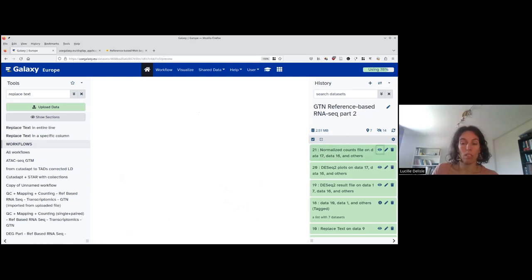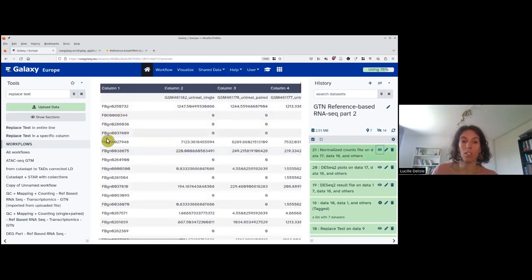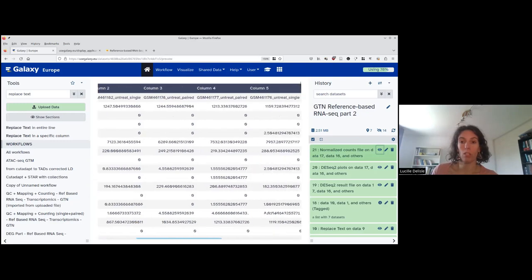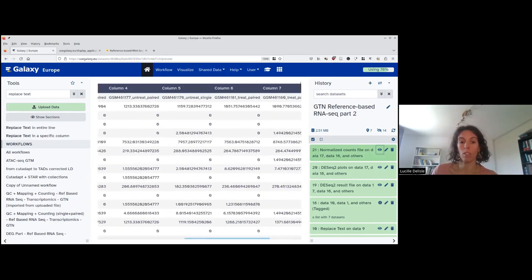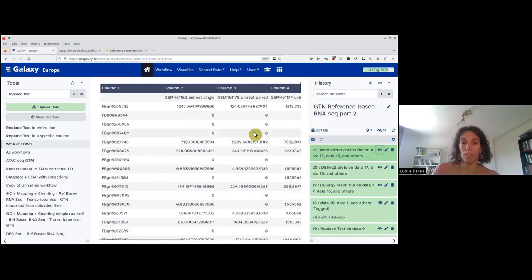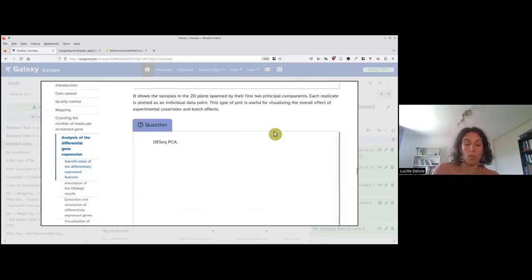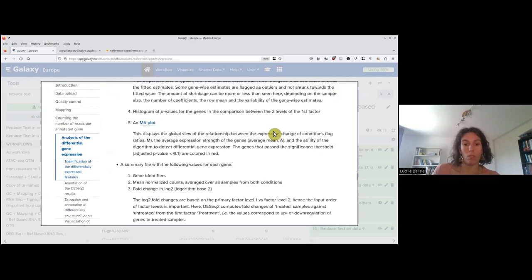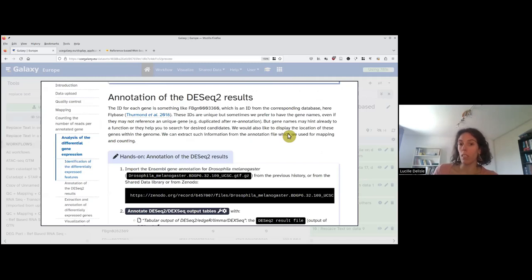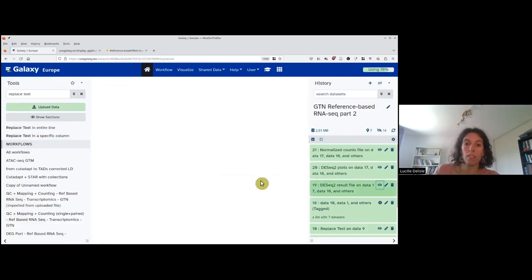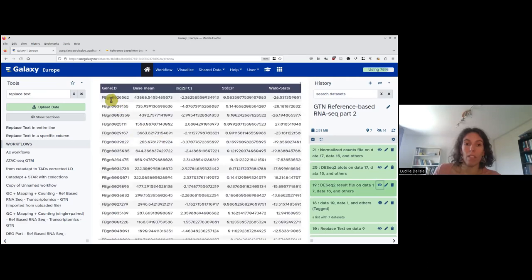The last output is the normalized count file — a table where each row is a gene, with the gene IDs and each column being a sample. There is a header with the name we gave to the collection.